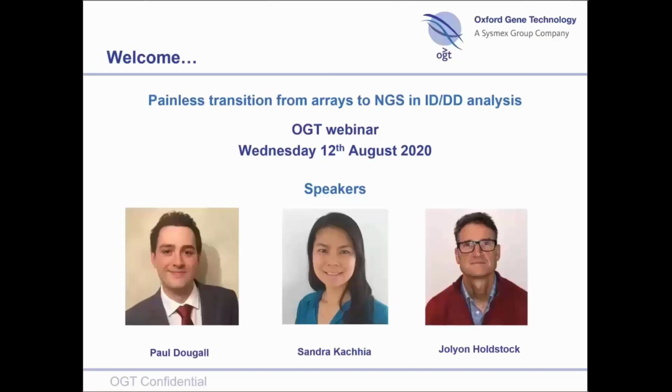Jolyon, how can I create a filter for a sample and use it on a protocol? What you'd do is you'd start with a basic protocol which let all variants through. You could then play with the filtering options you have and develop the filter of choice.